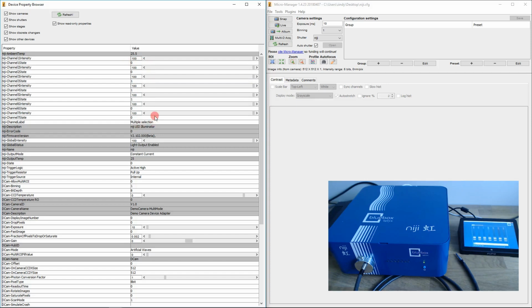We can have any numbers of presets with any combination of single or multiple LEDs. And likewise for the intensity, we have a global intensity control that controls all the LEDs at the same time. Or we can have multiple controls, one for each LED intensity.